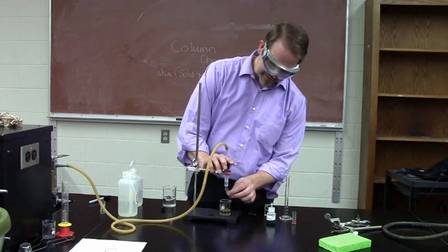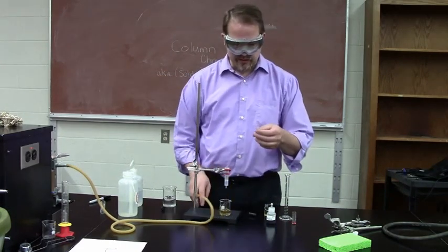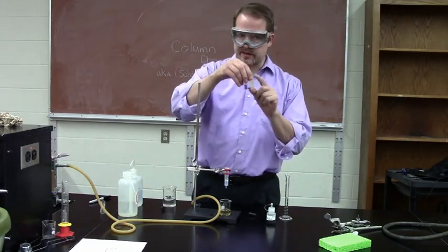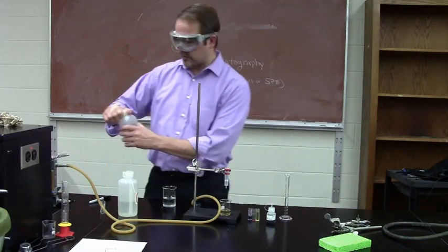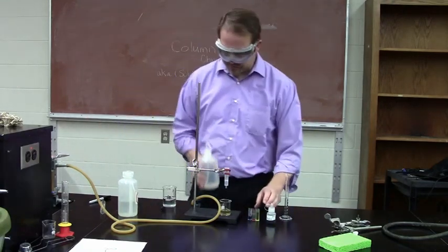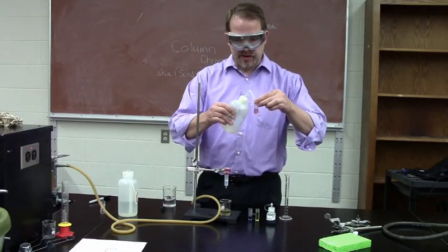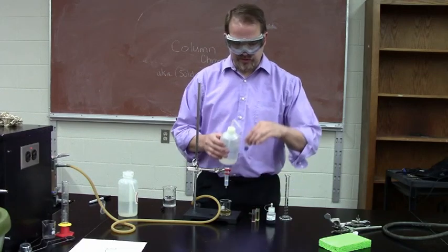So now I can get the blue to come off. Okay, so now I've got my blue, I've got my red, and I've got my yellow. And you'd say, oh, that's not enough for the light to go through the cuvette to actually do the reading on those. So I can go ahead and just fill them up with water to complete the rest. The spectrometer will work great and pick up the colors that we're going to need and do the absorption spectroscopy.